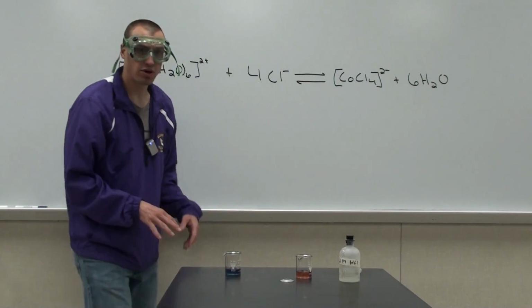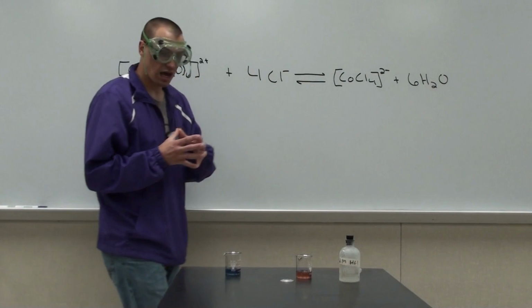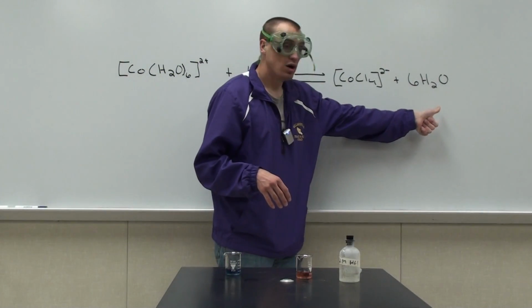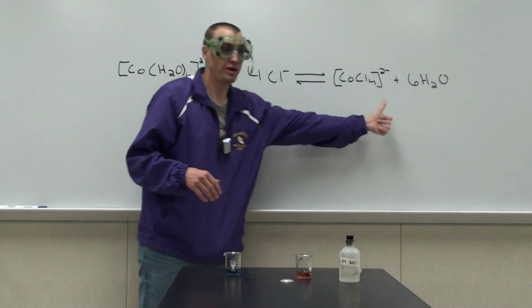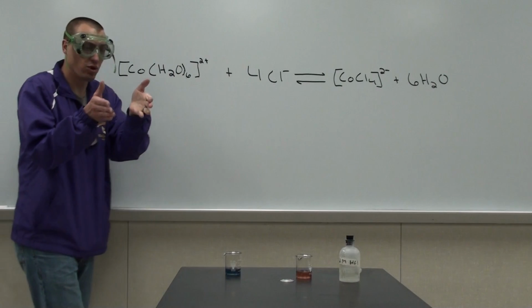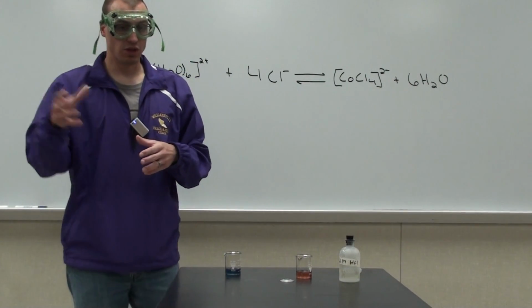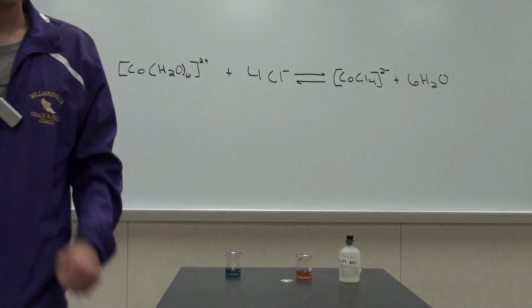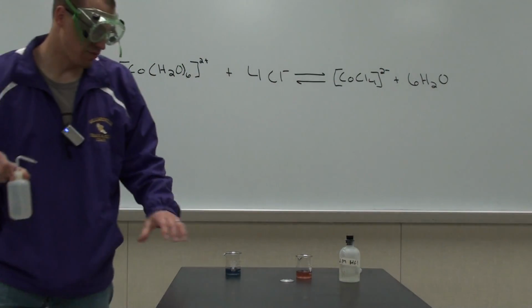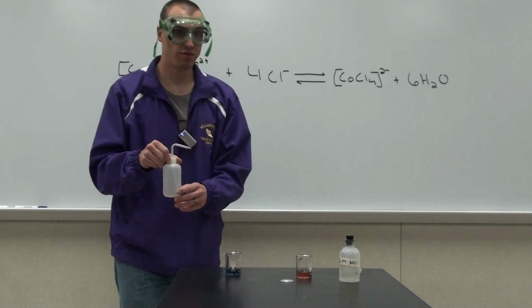Now our last part of our demonstration is we are going to take some distilled water and push the equation back to the reverse reaction, and we're going to have the solution at equilibrium. So let me go ahead and grab the distilled water, and I'm going to add it very slowly because equilibrium will be reached very, very quickly.